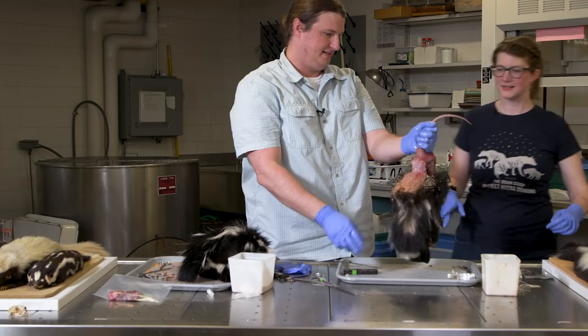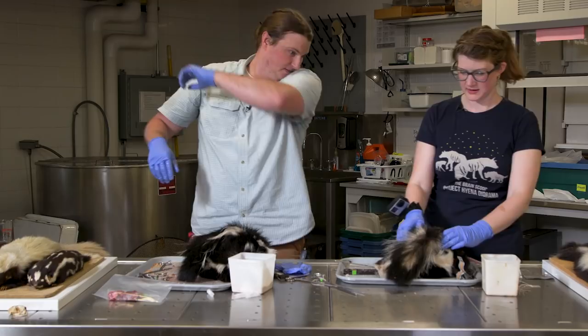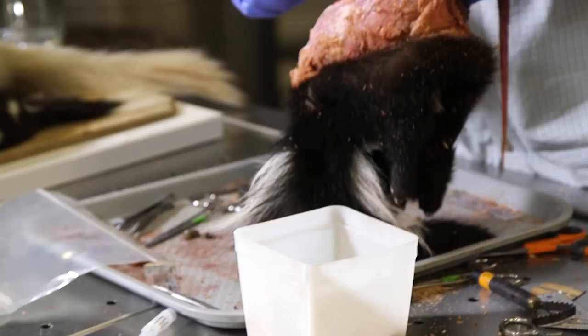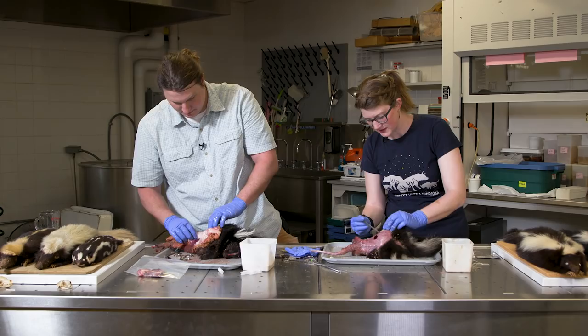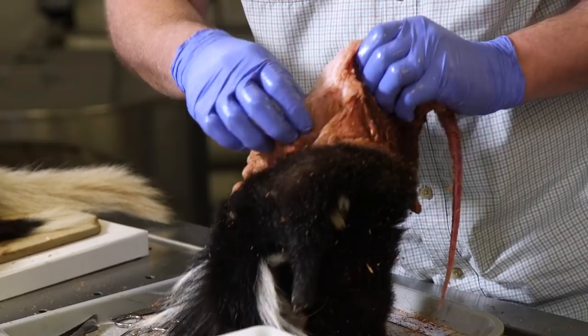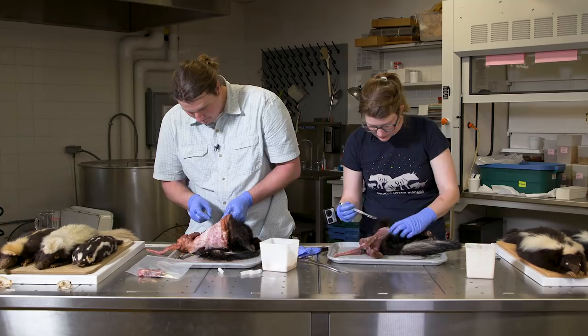Now this is just like any other mammal I've skinned — you just grip it and pull against the skin. Look at that layer of fat — that is a chunky skunk.